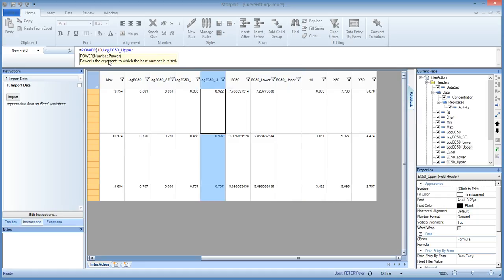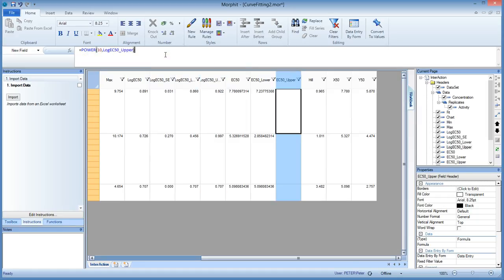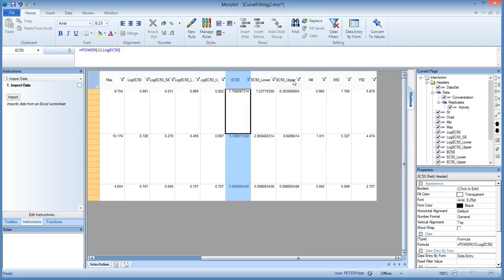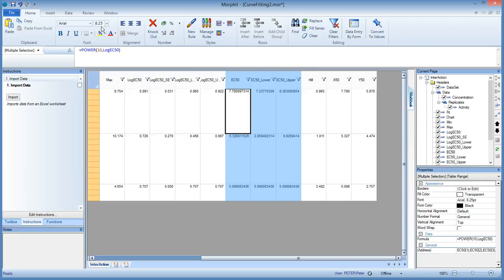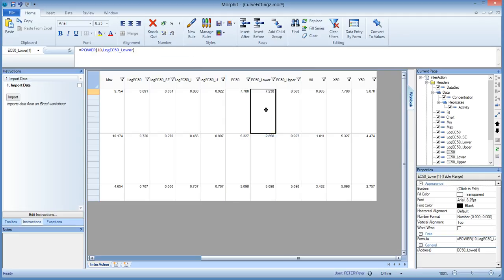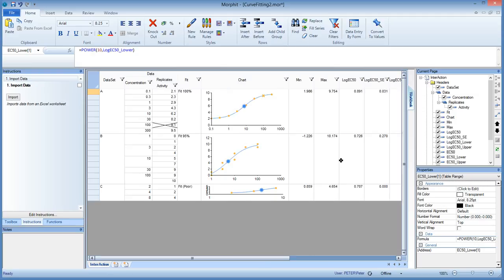And you only need to do this once to get to a nice production binder, of course. And this is right. Here we are. Now we have the EC50, and its lower and upper confidence interval.